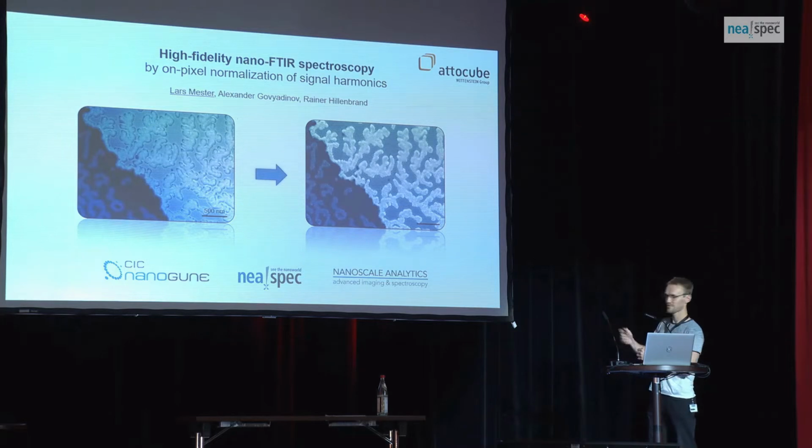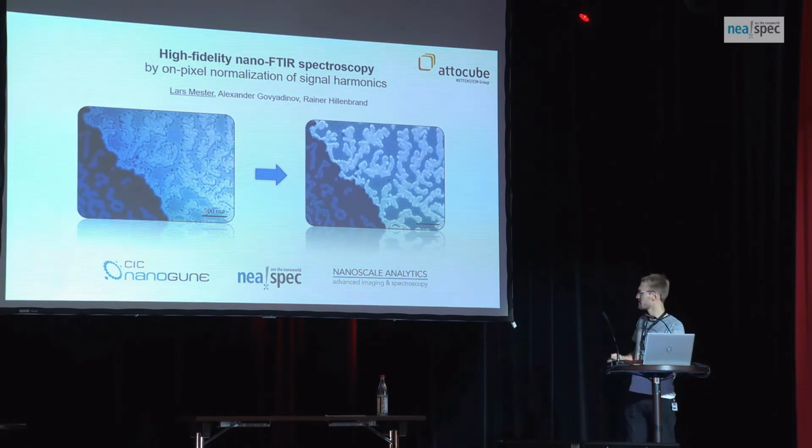I will talk about high-fidelity nano-FTIR spectroscopy. It's a very cryptic title, but we looked this up in a dictionary. High-fidelity means high accuracy, high reproducibility. This is what we want to achieve.